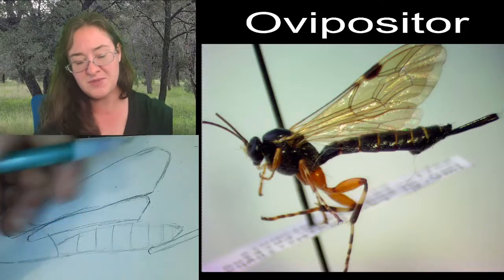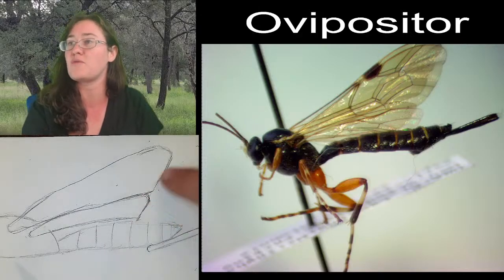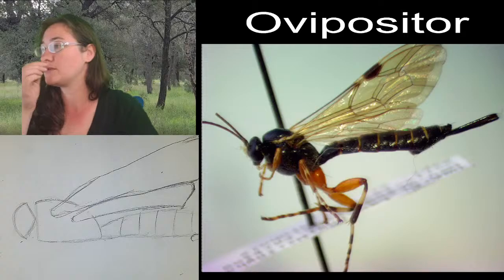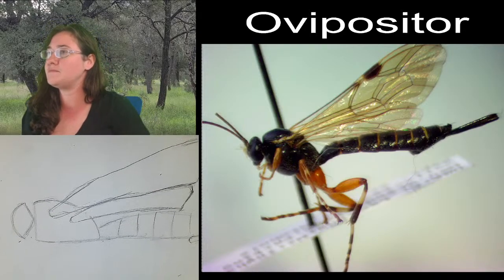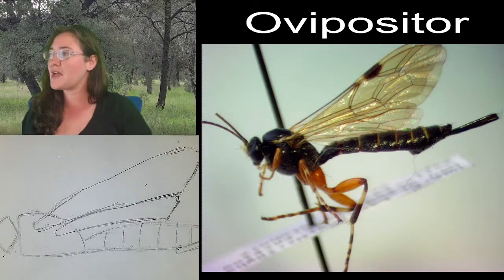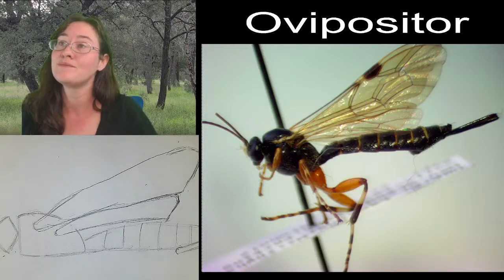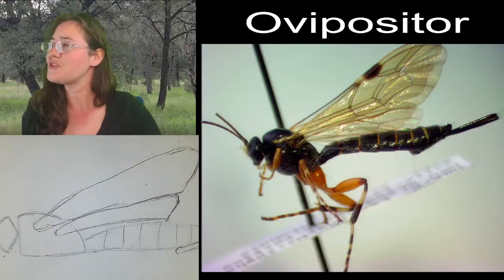And a lot of times the hind wing also has an angle, and you can use this angle from our front wing to kind of align the hind wing. Thinking back, I'm realizing that every wasp seems to have basically the same shape of wings, the one big and the one small, and basically the same shape. Yeah? You're right.